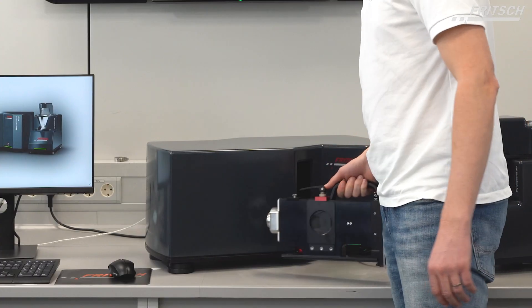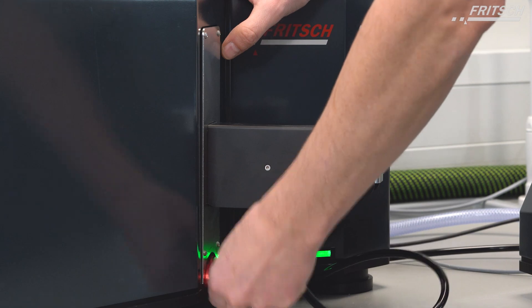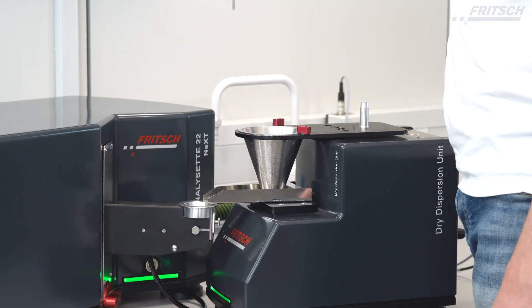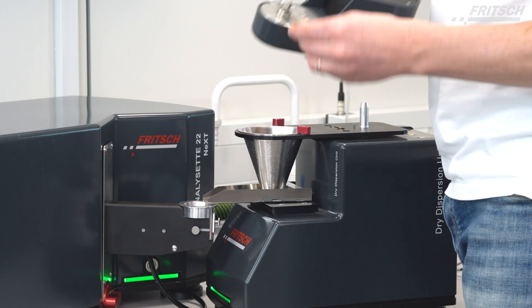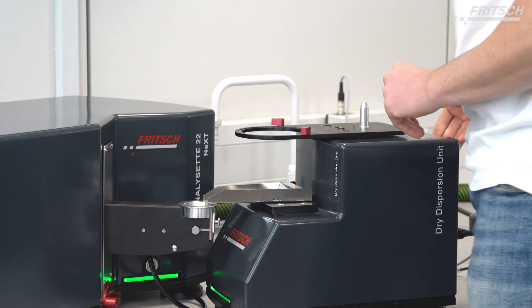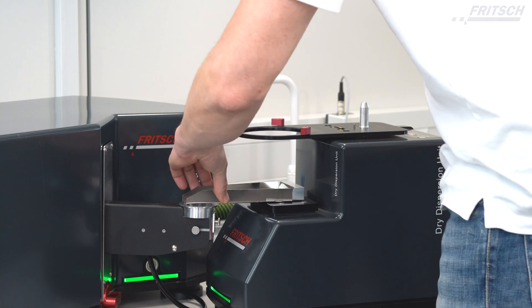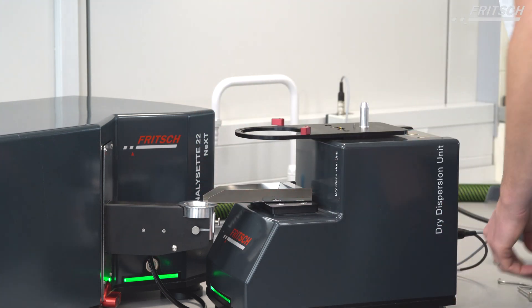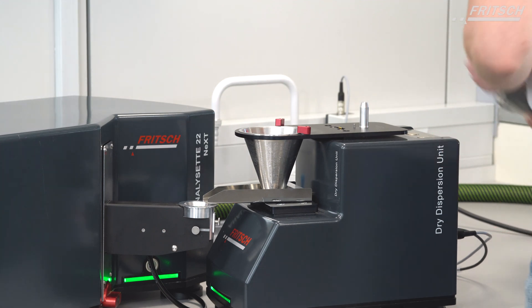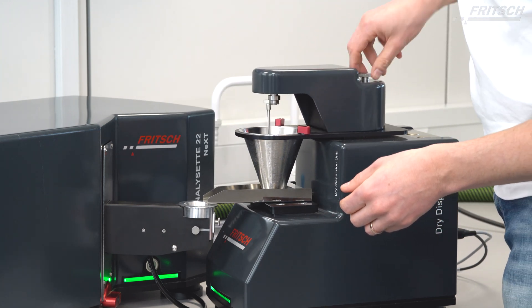Once everything is clean again, you just insert the glass back into the cell, push the red holder forward, and close the quick release. Once everything is assembled back together, you take the cell and insert it into the unit. All the parts which come in touch with the sample are very easily disassembled. The feeder can be easily released by the release button, taken out of the instrument, reassembled, and fastened by the release button again. The funnel is held by two manually movable screws, and the stirrer is just put back in and the screw fastened.